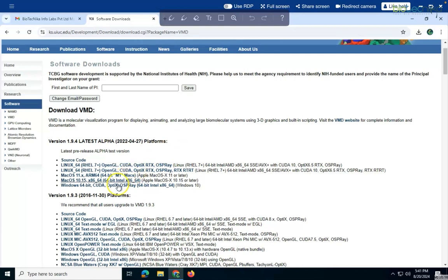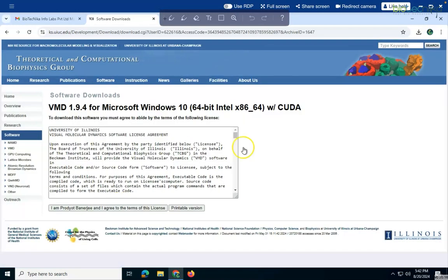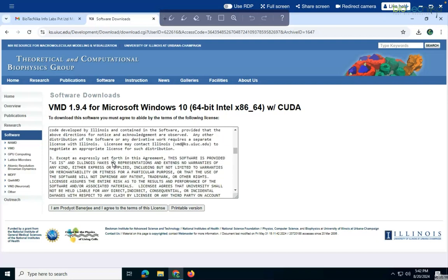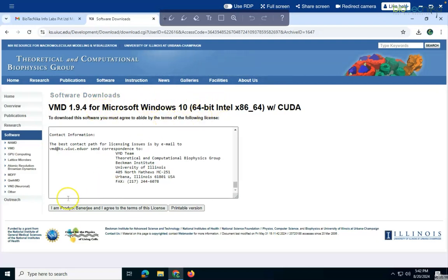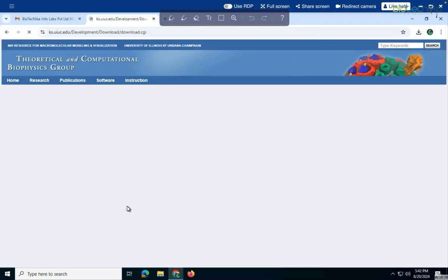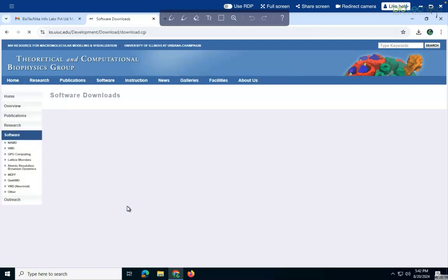So here I am having the operating system as Windows. So I can click on this, that is a 64-bit processor. So I can agree on this all those things. So before this you might be having a registration part. So as I have already registered, that is why it is able to recognize that, see I am Pradit Banerjee and agreeing on this particular licenses. I can agree on all of this.